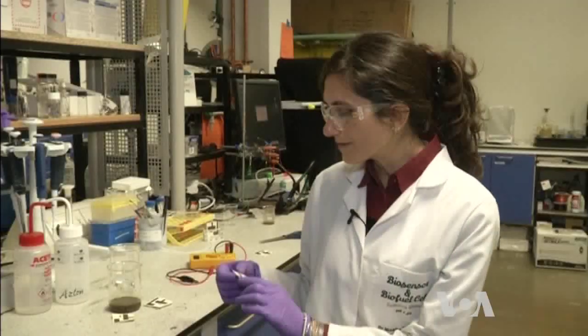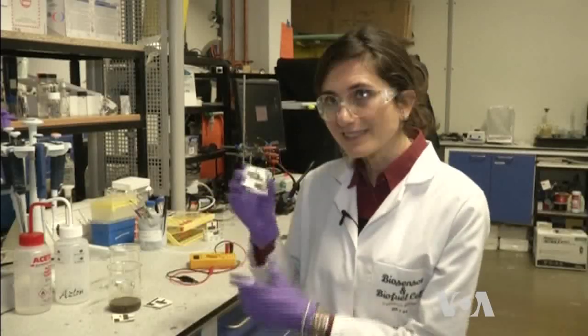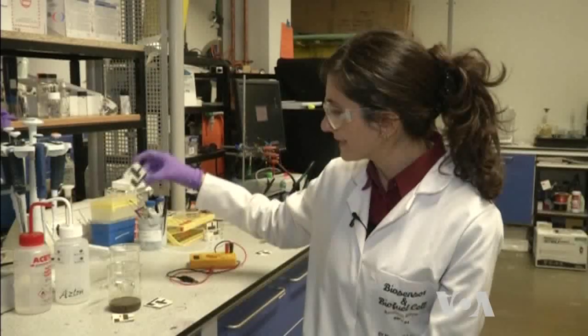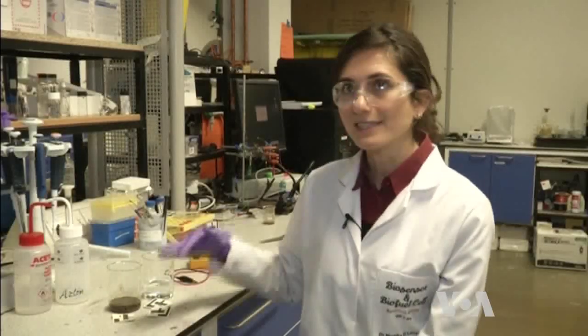All that we need to do is record the background current signal that this device gives us, and then put it into the sample of water that we want to test and see whether this signal drops or stays constant.